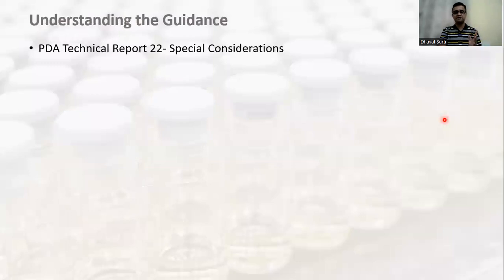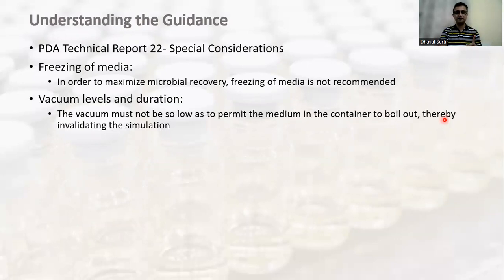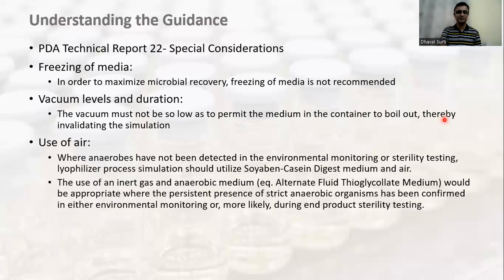Now there are some special considerations in PDA Technical Report 22. Let's understand. Freezing of media: in order to maximize microbial recovery, freezing of media is not recommended. That is one. We should not freeze the media. Vacuum levels and duration: the vacuum must not be so low as to permit the medium in the container to boil out, thereby invalidating the simulation. So we don't have to pull too much vacuum, so that the media will boil out of the container and invalidate the actual media fill simulation.